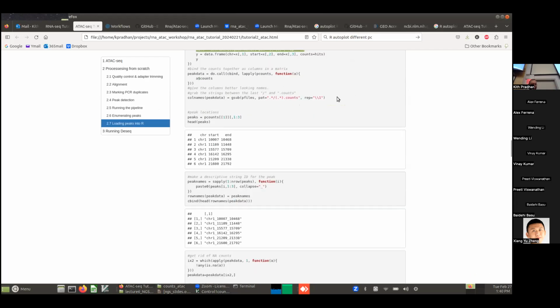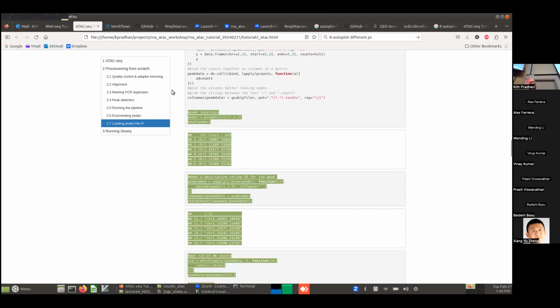This is just this stuff here, just prettying up the name, because a lot of times when you're working with data or working with samples, they might have a big, long, complex name with all these lanes and maybe date or other information that you're not really interested in. This is just cleaning all that information, so you're just dealing with a very simple, easy to use sample name.